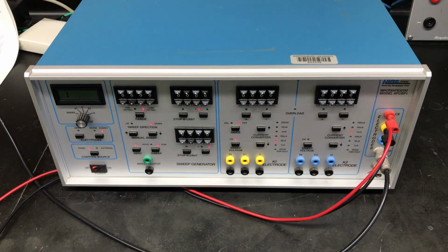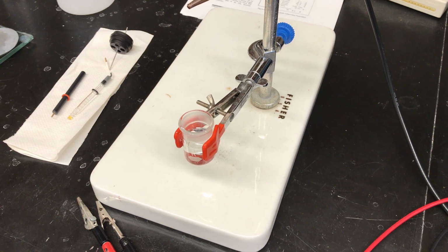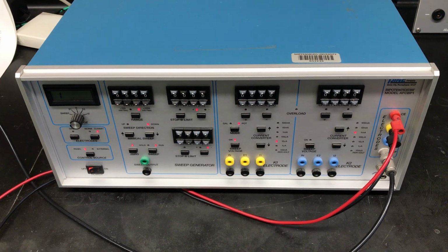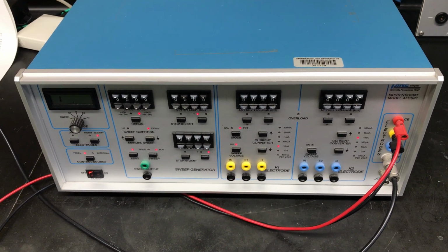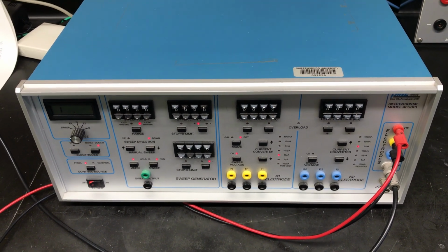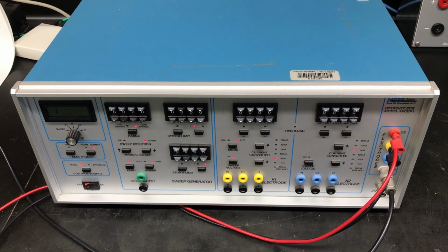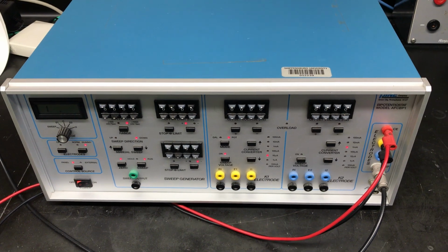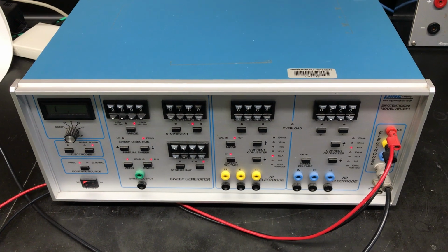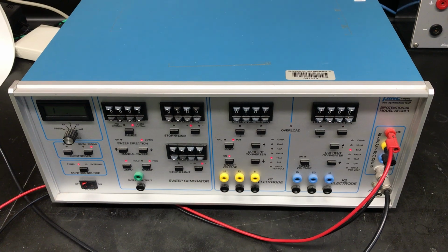a potentiostat. The potentiostat will be connected to the electrochemical cell, which we will be constructing here in a few moments. And the job of the potentiostat is to apply an appropriate potential or voltage to the electrode where the oxidation and reduction of the analyte of interest will take place. Now, as a result of that oxidation reduction process, a current will also flow at that electrode, which becomes our analytical signal. So the potentiostat's other job is to measure that current flowing at that electrode where the oxidation and reduction of the analyte takes place.